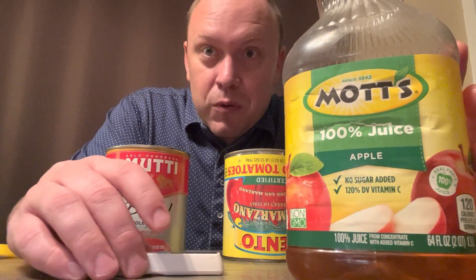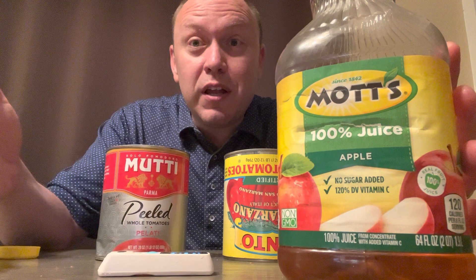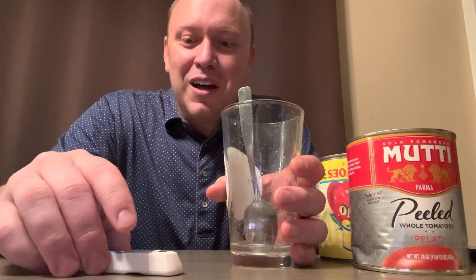See how the tomato juices in the tomato cans contrast. We're going to measure this apple juice, which comes in at 12%. And now we'll use what we think is a really sugary solution — this cola. We're measuring 10.1% sugar. Now we'll measure this can of iced tea lemonade — this is the light version — and that comes in at 5.9%.